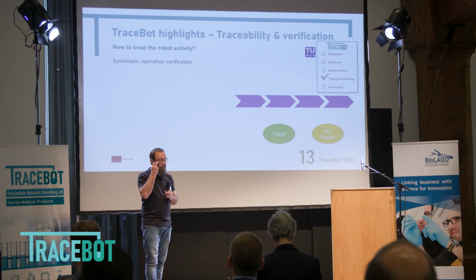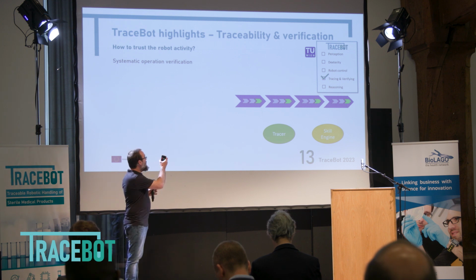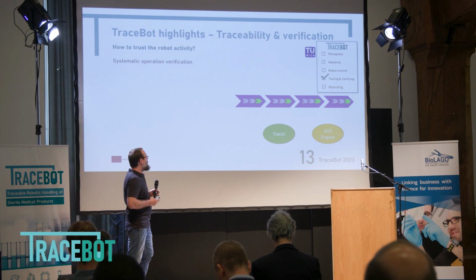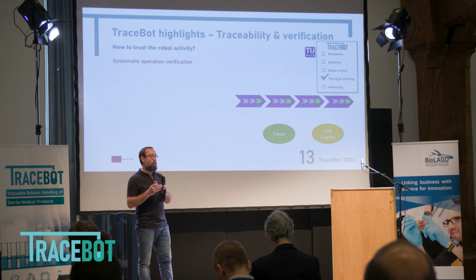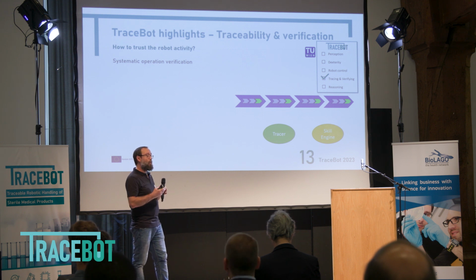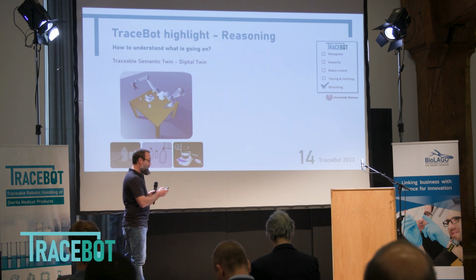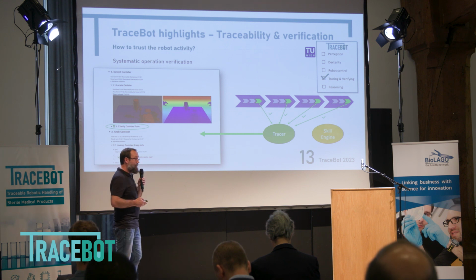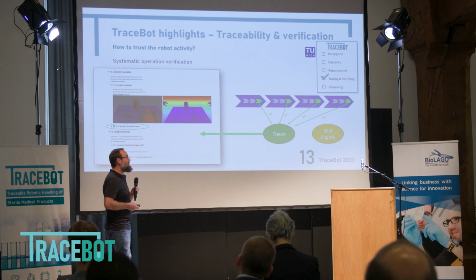Similarly, if we assume that these skills that are generated and implemented in the system are structured in a hierarchical way, based on intermediate sub-skills, then we can enforce the system to incorporate some verification processes. Verification operations focus on verifying that the current task is done correctly, so that we can automatically, again, collect that information and provide it in the audit trail to specify that the pose estimation has been verified and is correct according to our verification schemes.